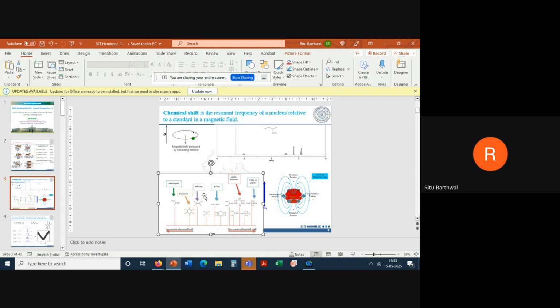One more additional effect you have to see: when we have aromatic, it is shifted away because they are delocalized. Another effect is, if you have a proton with something above it, another H above it, it will experience upfield shift. Something on this side will experience downfield shift for a similar reason, because aromatics have ring current effects. So what we have got is a standard scale available. You will find it easily. So there is a range.